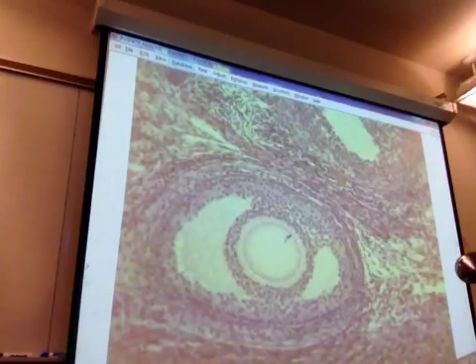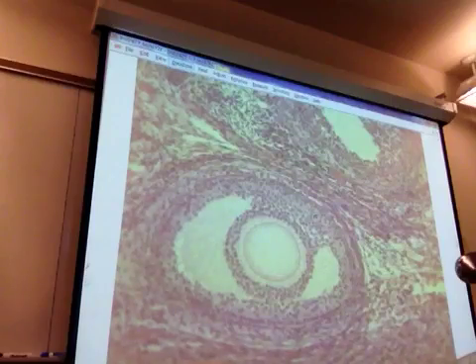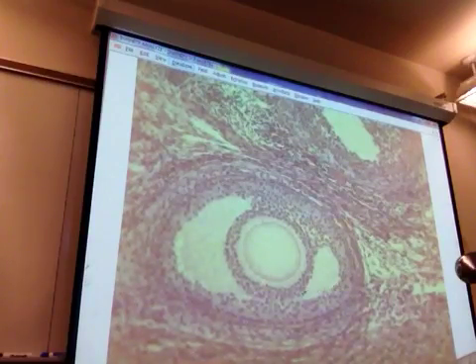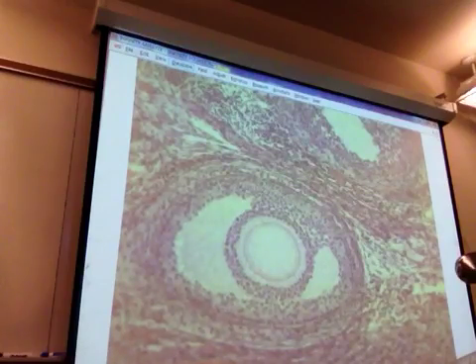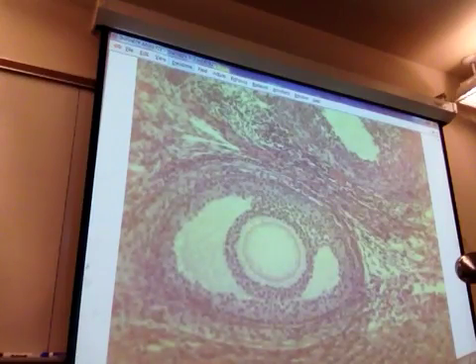Here's some really good granulosa cells too. See how cuboidal those look? And then you start getting further out into the theca cells, and the theca cells are a little bit of a different color. And that is the same color all the way around here. And then see how there's definitely that demarcation of where the follicle ends, and out here is all the follicular cells? Yeah.